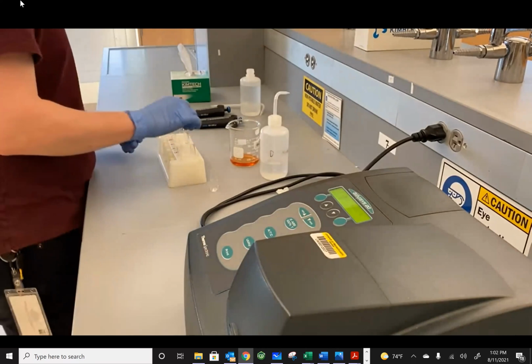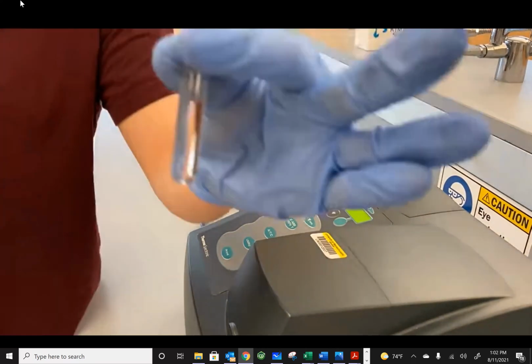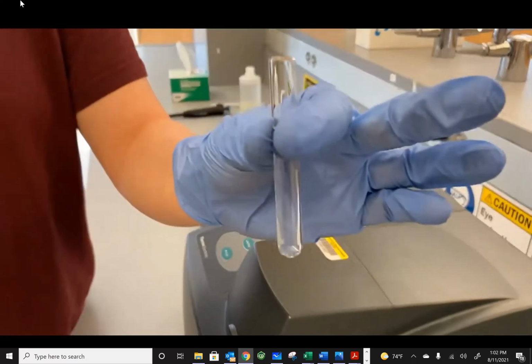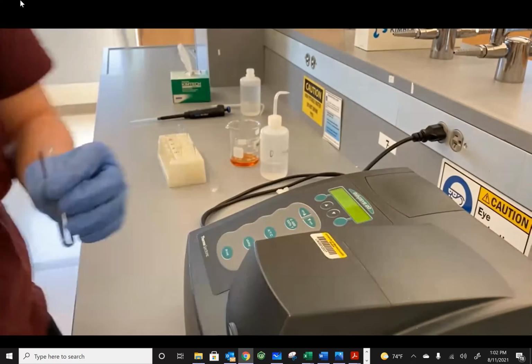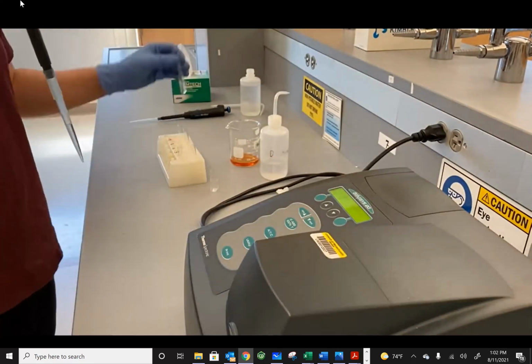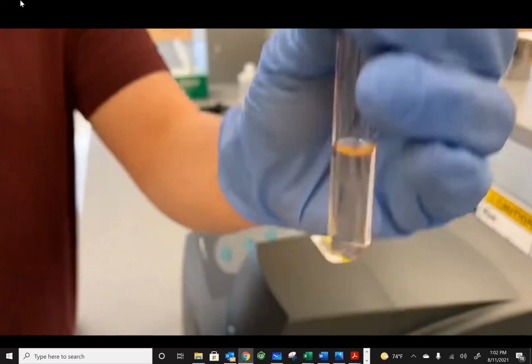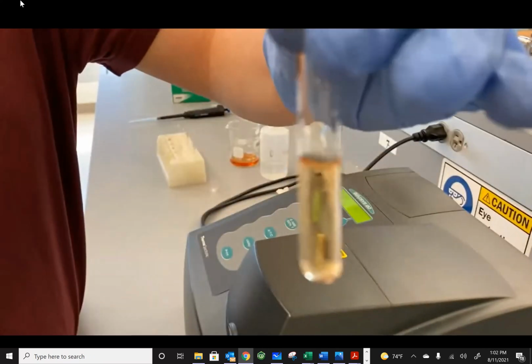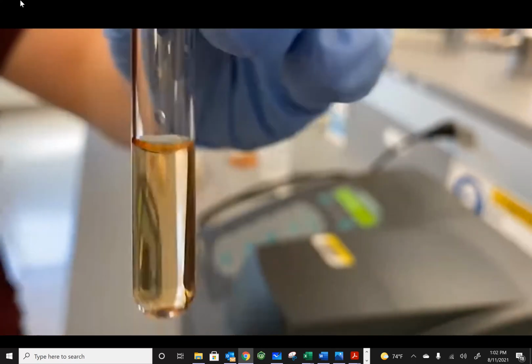Now, when we take our ligand, we'll take 400 microliters of the ligand. This is also a clear substance that looks just like water. Take 400 microliters in a micropipette, and we will deposit it into our metal. As you can see, hopefully, it changed color to that slight red tint that we saw in the standard.